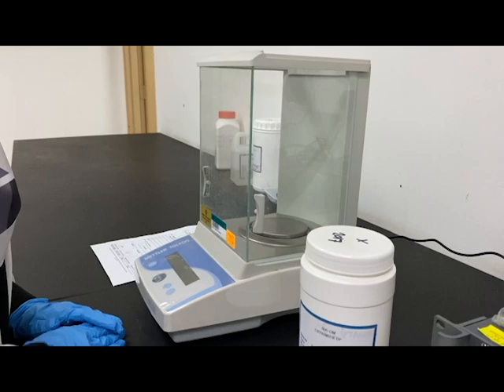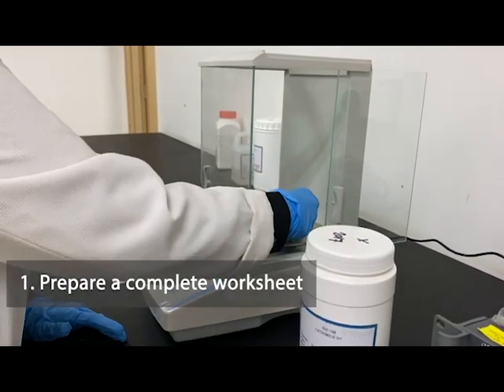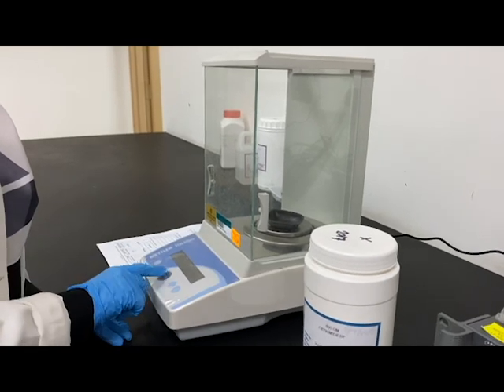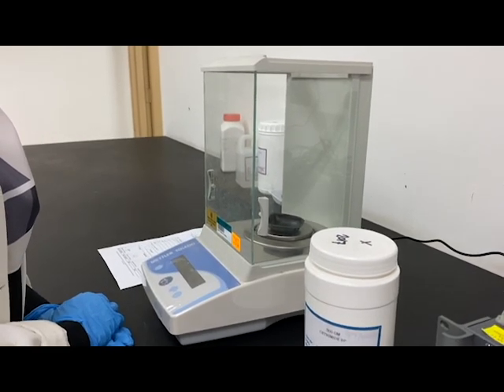Before starting your extemporaneous preparation, you need to prepare a complete worksheet. This is to guide you to determine the correct amount of each ingredient required and the correct procedure for your preparation.